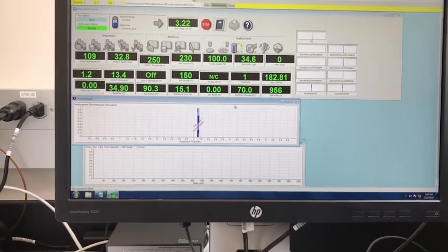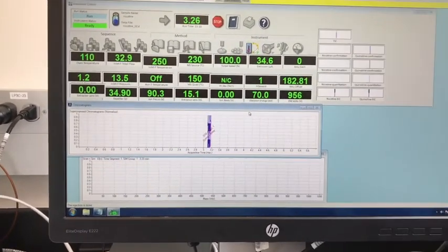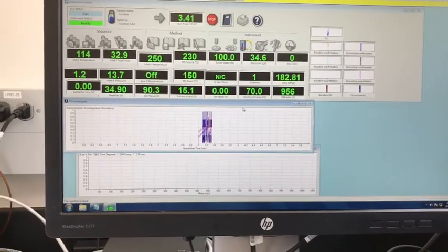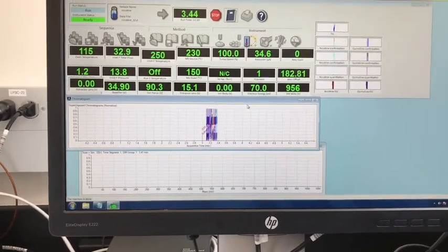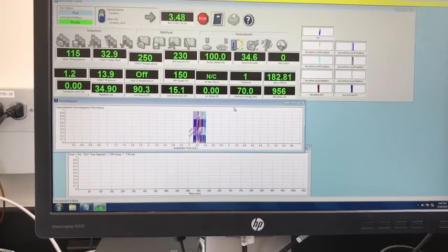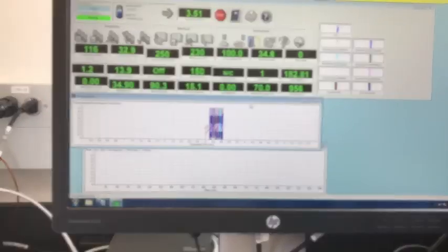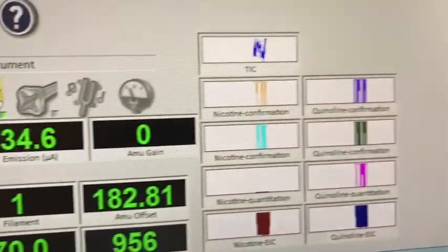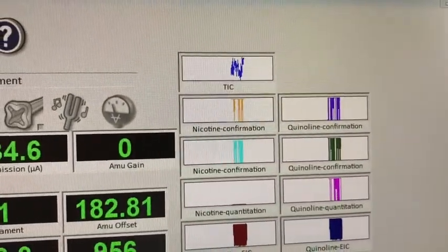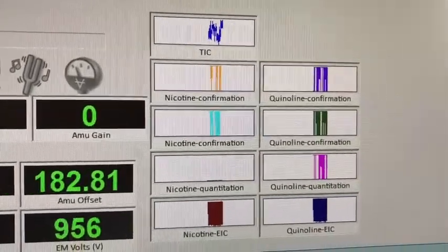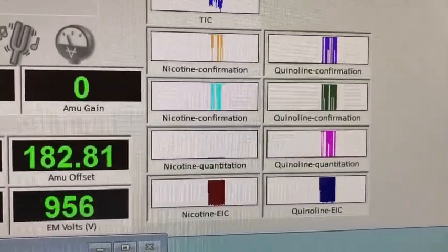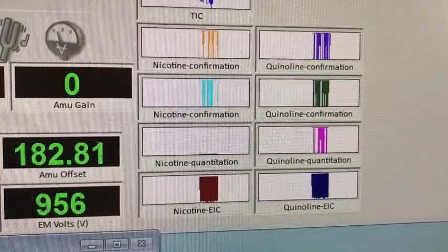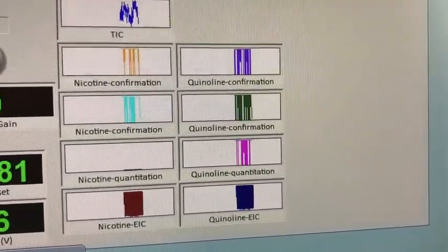The peaks are starting to come out. Just like any chromatogram, it will give us peaks for each sample. Right now there appear to be a lot of peaks. The TIC stands for total ion chromatogram. Then we have the nicotine confirmation peaks, the nicotine quantitation peaks, and the ones for quinoline as well.